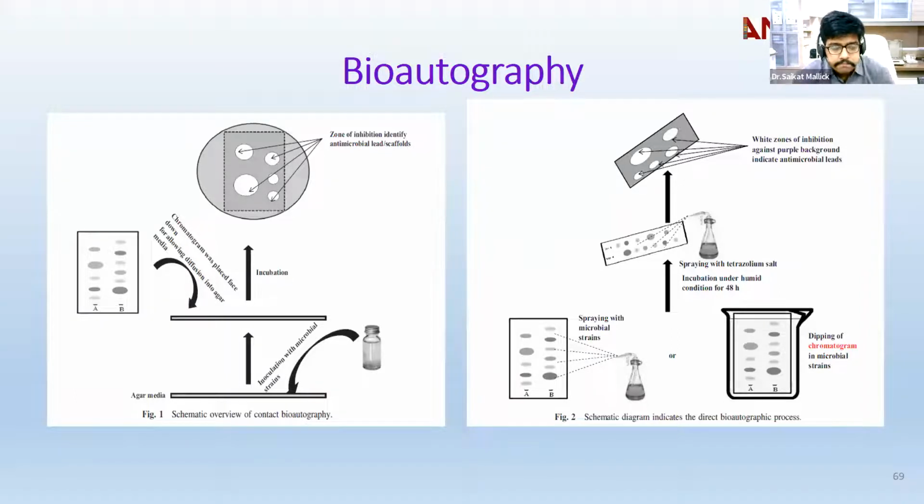So the first one over here, you can see they have taken the plate, and then first they have taken the bacterial strain which they are interested in. There are many strains available, but with permission you have to do this. There are strains like Staphylococcus and Bacillus species, and if you go for antimicrobial estimation, a group of 3 gram positive and 3 gram negative bacteria are present, which you can find at many websites. The popular ones are not that virulent in nature, meaning they cannot infect people, but they can be used for testing the function of antimicrobial activity.